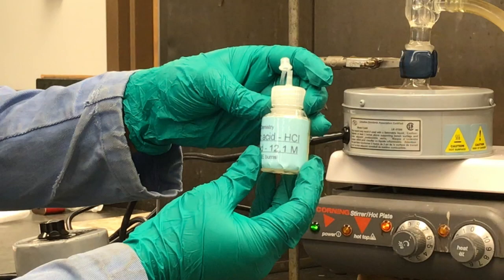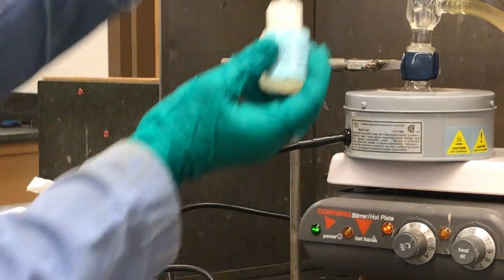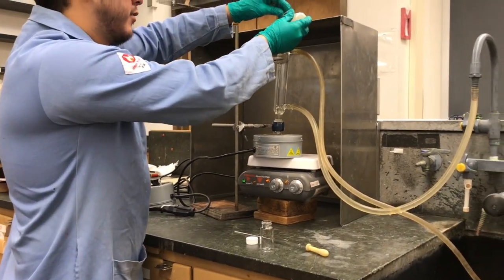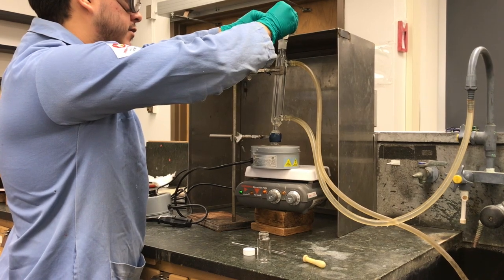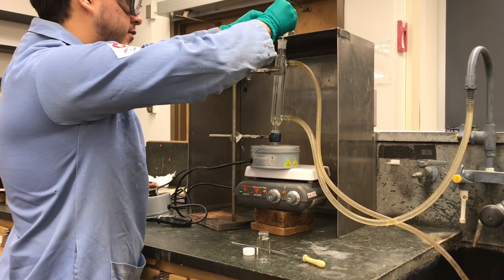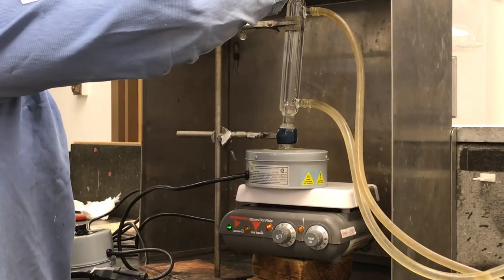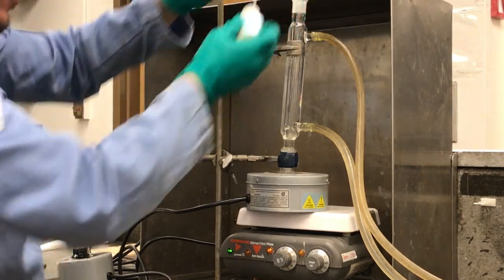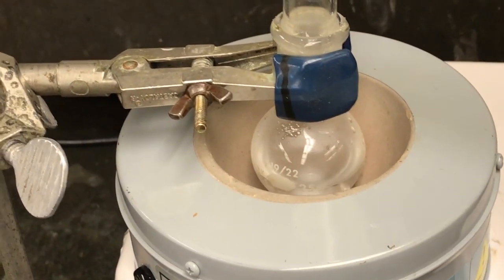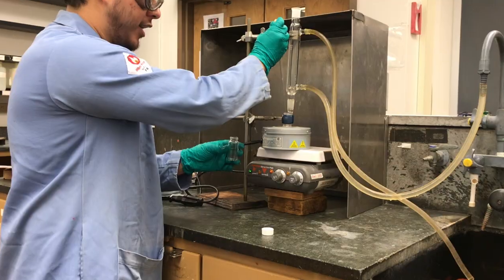So in order for the reaction to proceed, we need to have acidic conditions. So here we have concentrated hydrochloric acid, and we're going to add 10 drops from the top of the reflux condenser. I'll show you guys a close-up of the reaction. You can see it's still pretty colorless, but it's just getting a little bit foggy.